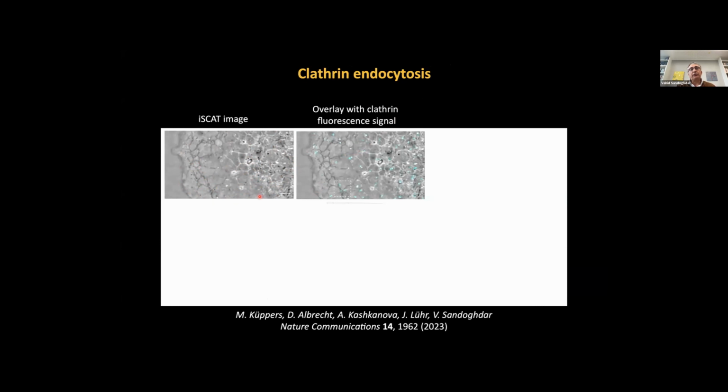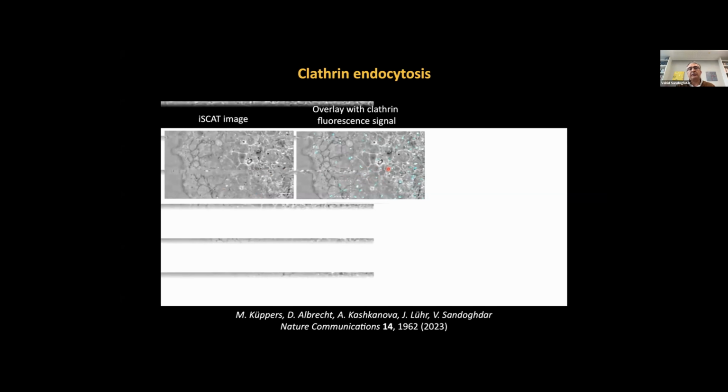If you just see a black spot, you know that it's probably a nanoparticle, but you don't know exactly what kind. But knowing your application and a little bit of cell biology, you can guess. In this case, we ruled out a few things and we realized that these must be clathrin pits. So then they were labeled, and that confirmed that these were all clathrin.